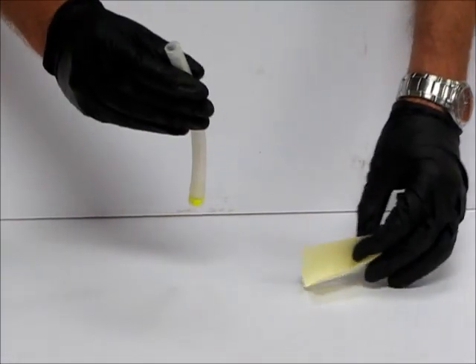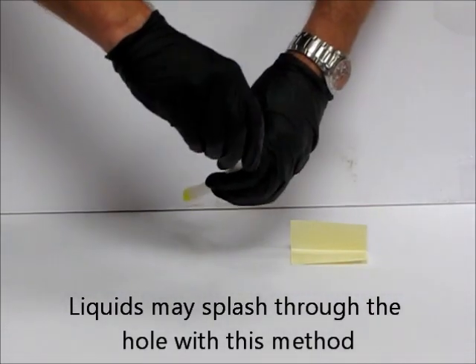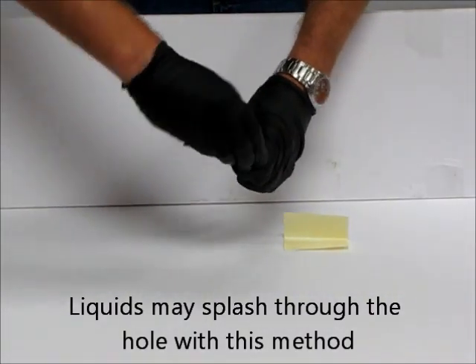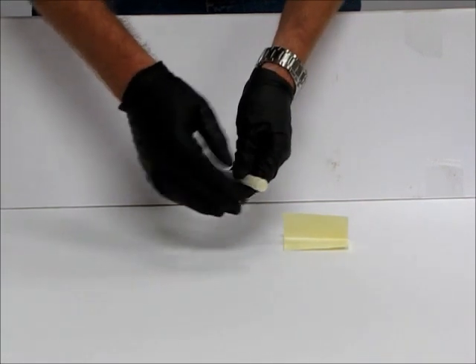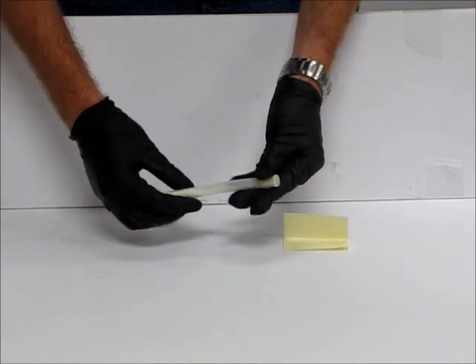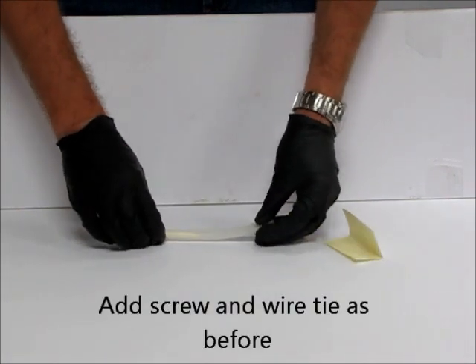It is important to note that liquids may splash through the hole using this method, therefore creating a potential safety issue. You then add the screw and wire tie as shown before.